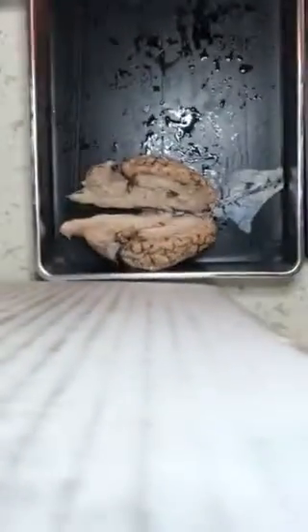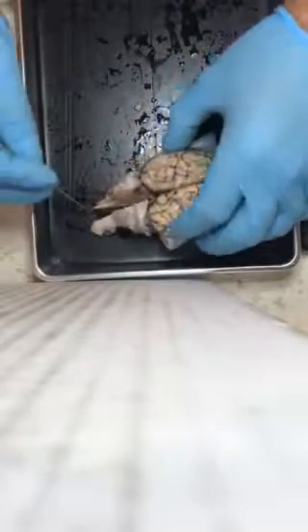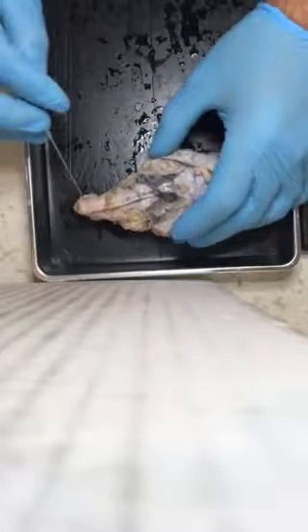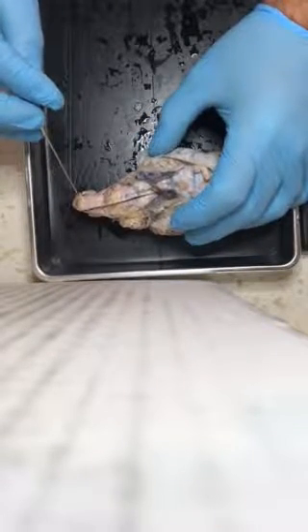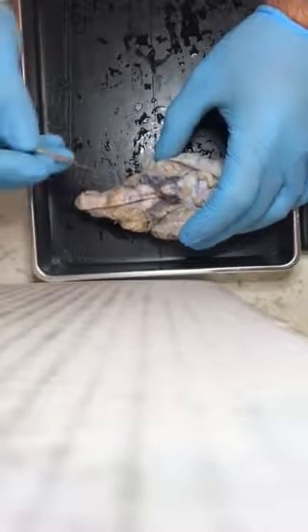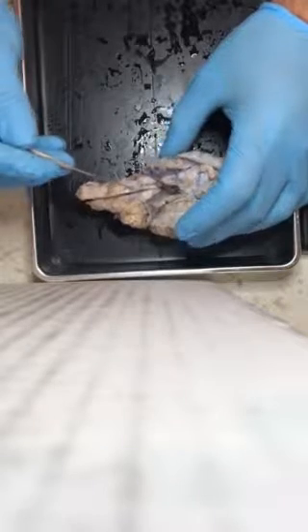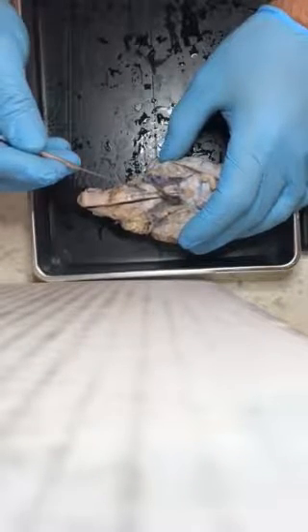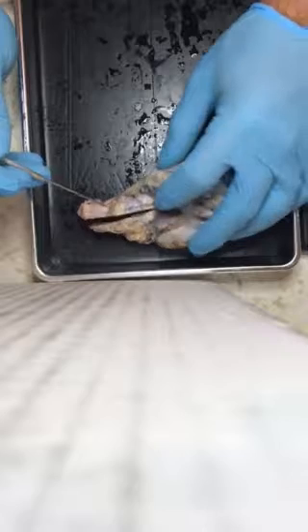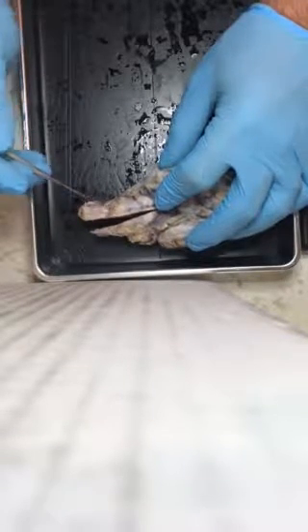All right, so the brainstem. So this is going to be the brainstem from this angle. I'm back here. This is the brainstem again. We have the cerebral peduncles, which are going to be on either side here. We have the pons. The pons is going to be right here. And we have the medulla oblongata, which is dissected again, but it's going to be right here. Medulla oblongata.